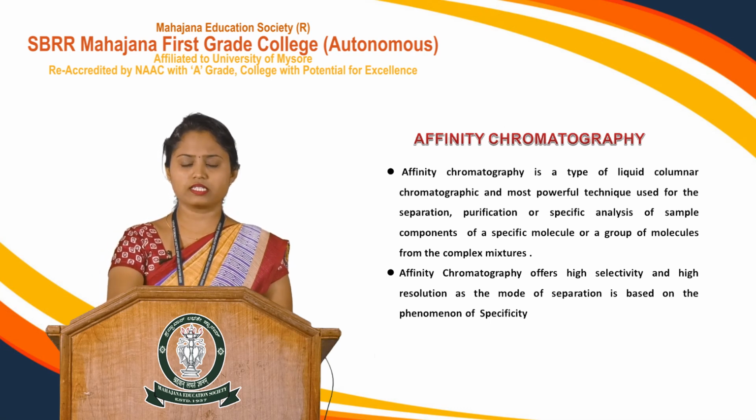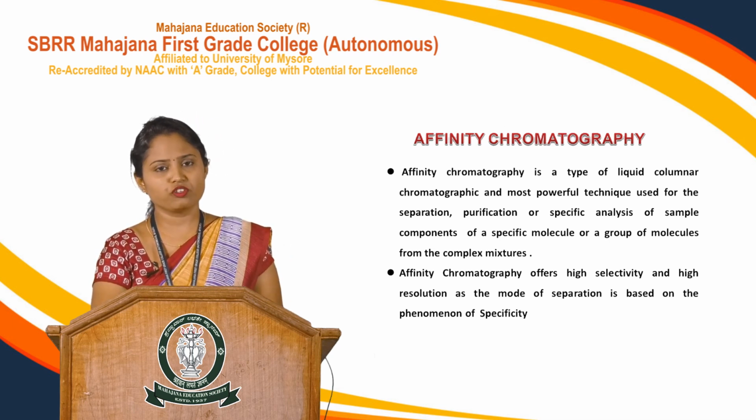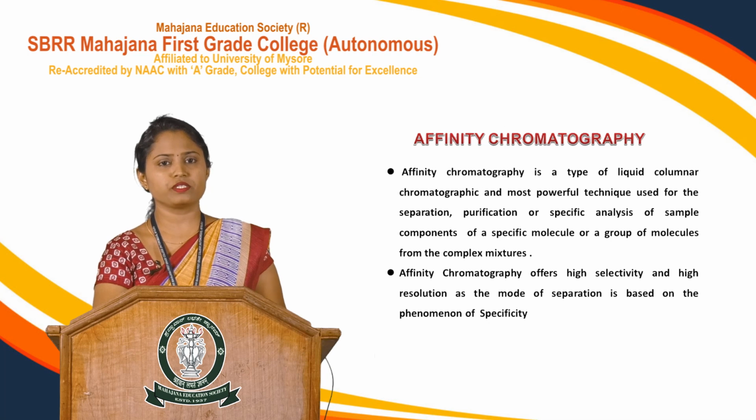This technique plays a very important role in isolating various biomolecules, as I mentioned. It also plays a very important role in immunology for the separation of antibodies, protein purifications, even in enzyme kinetics, the separation of specific enzymes.